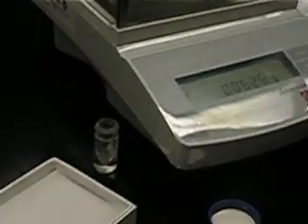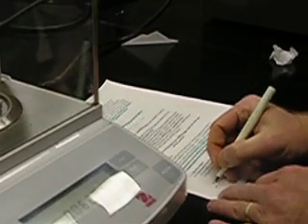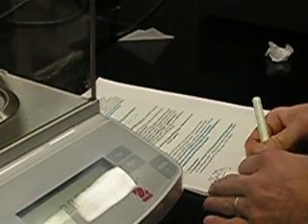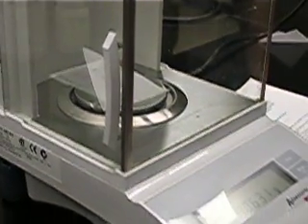We do not want to remove solid and put it back into the primary container. We simply write this value down: 0.0629 grams. We have come as close to 0.05 grams as possible, and we are ready to move on.